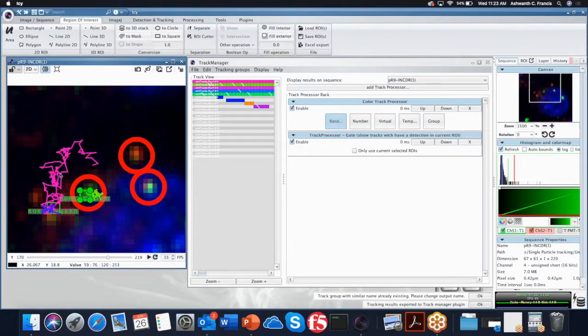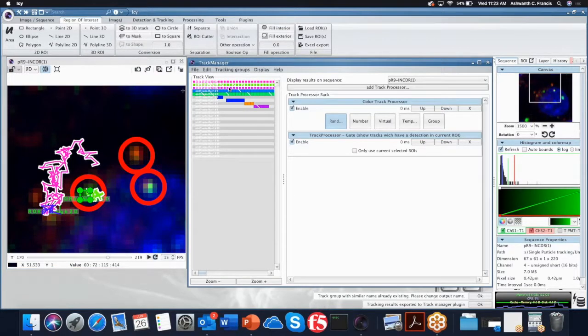Once you've identified this, you can actually highlight these tracks. If you click on the track directly, you can highlight it, and then you click on this track, and you highlight these two tracks inside the track manager. Okay, so when you select the track on the image, you're also selecting the track inside your track manager. So you can just go ahead and select a track that you like. Okay, any track, it doesn't matter. So once you've chosen your track, right, you don't want to use any of these other tracks. If you want, you can keep some of the tracks. For example, I'll just click on this and this. Maybe I'll keep these tracks, right? So I've chosen a bunch of tracks in this manner on my image, okay?